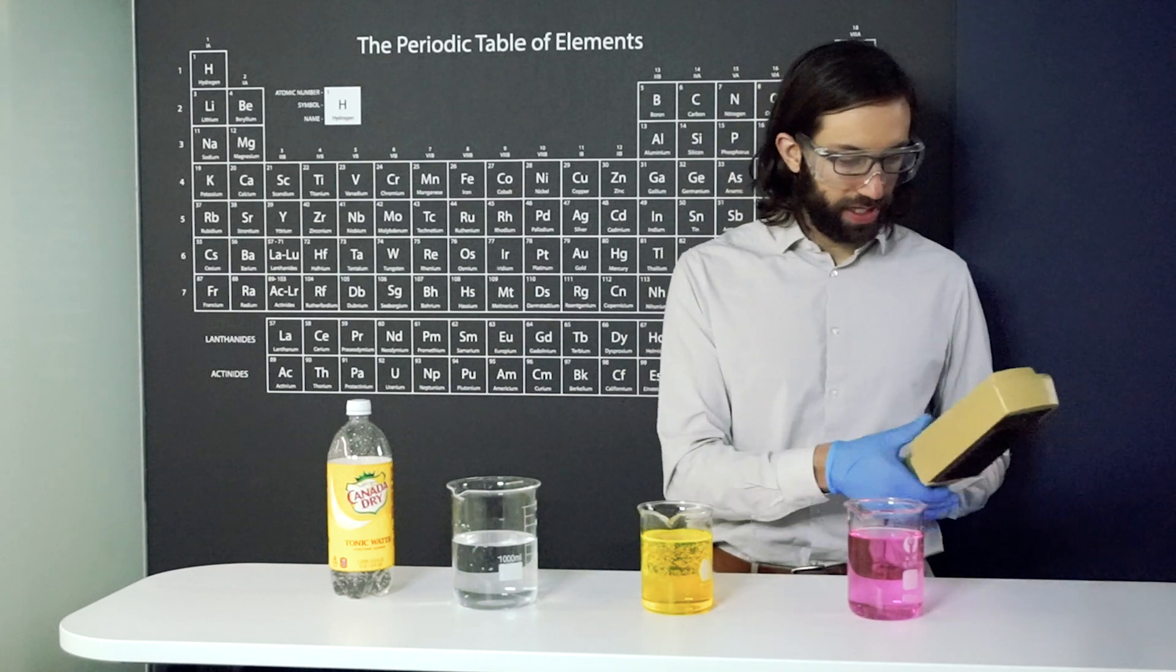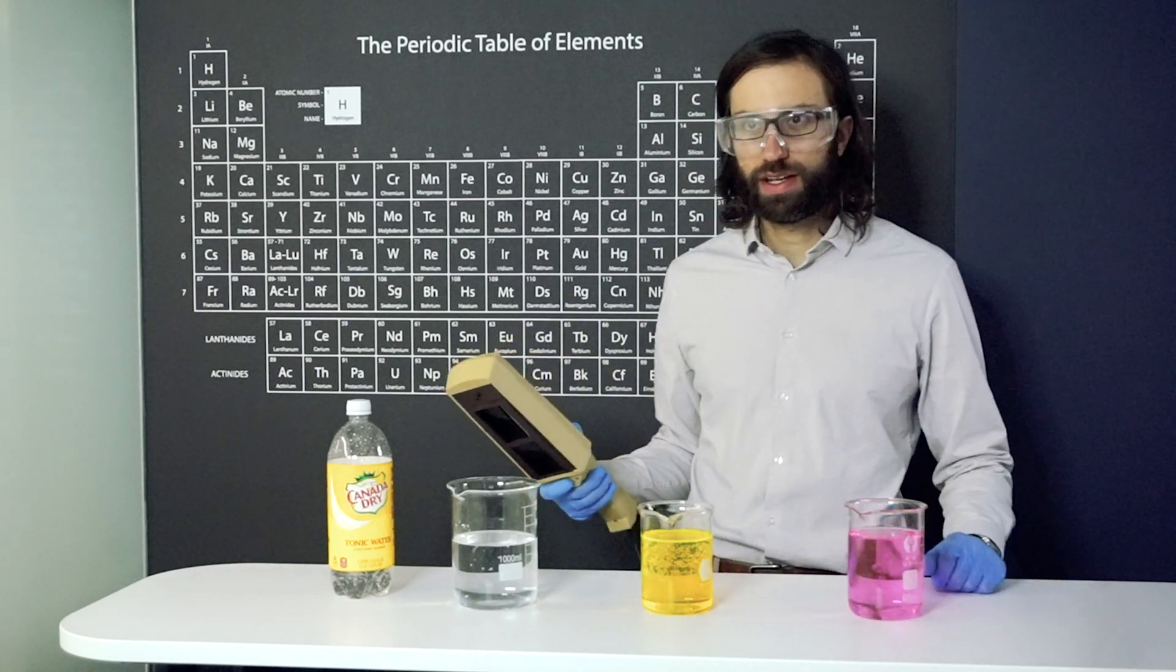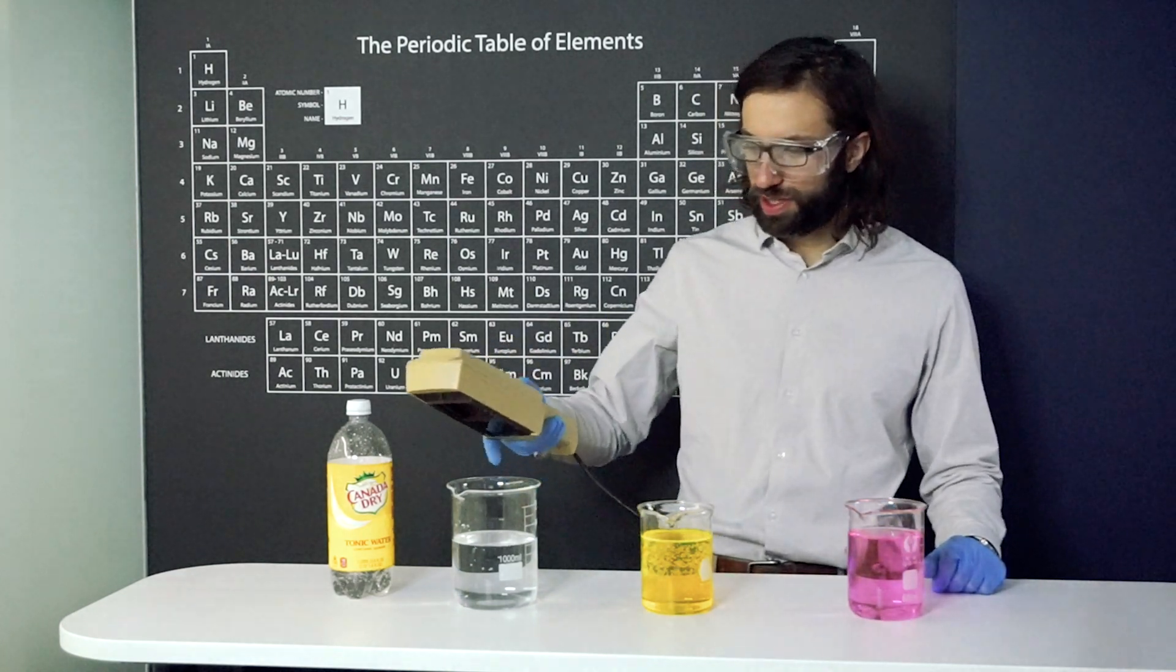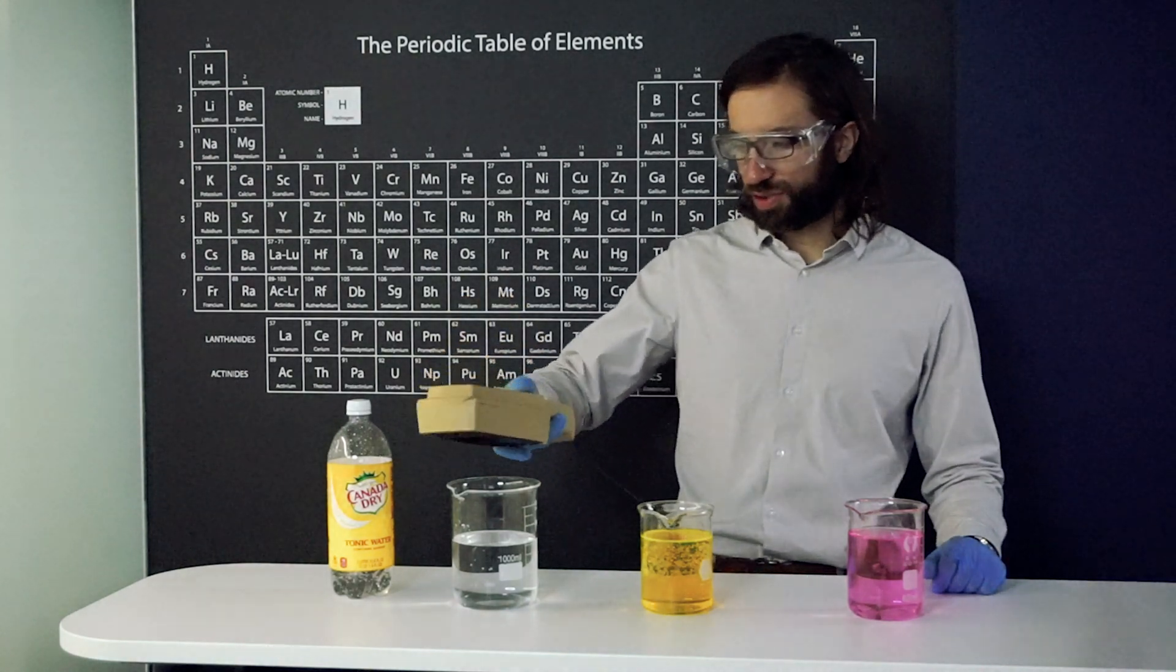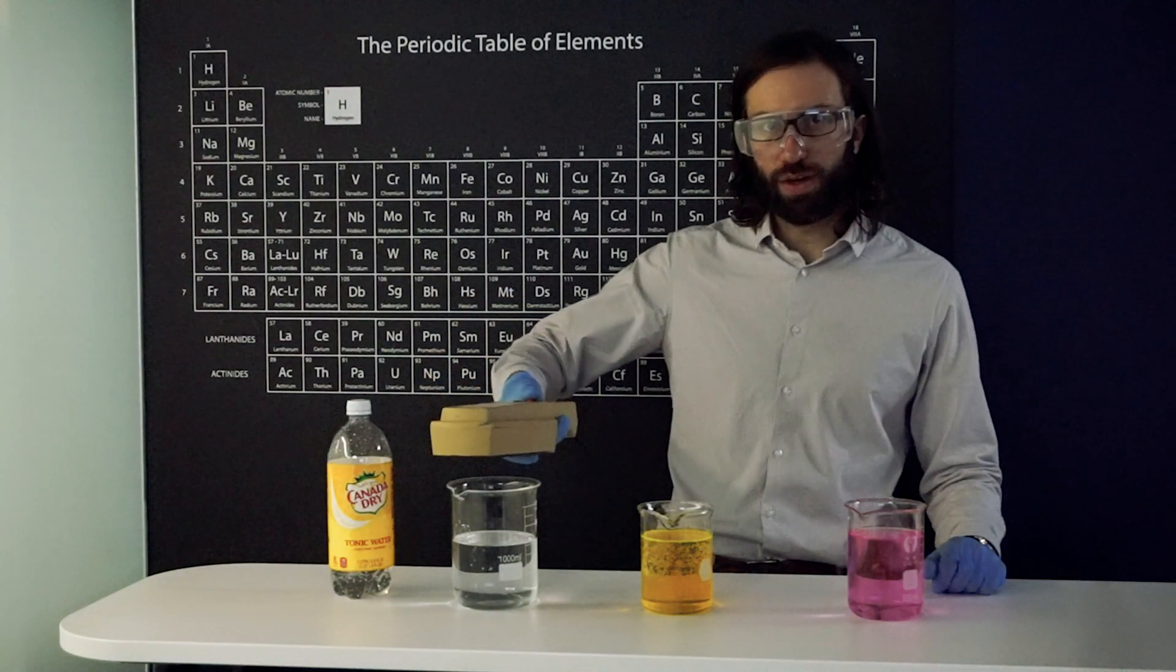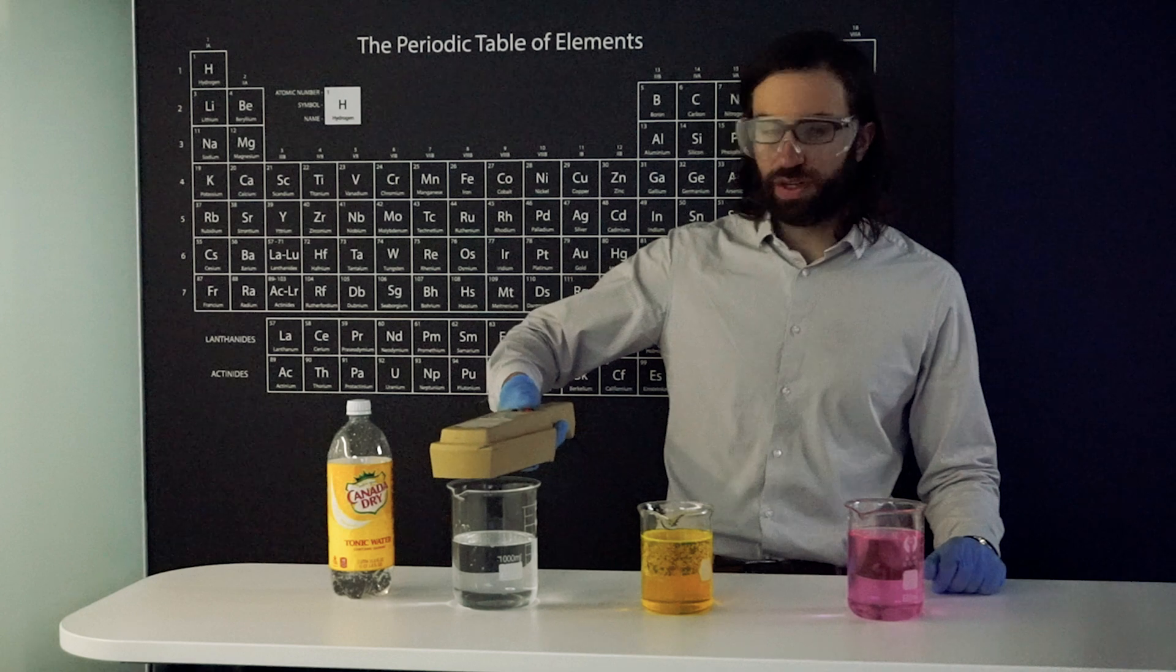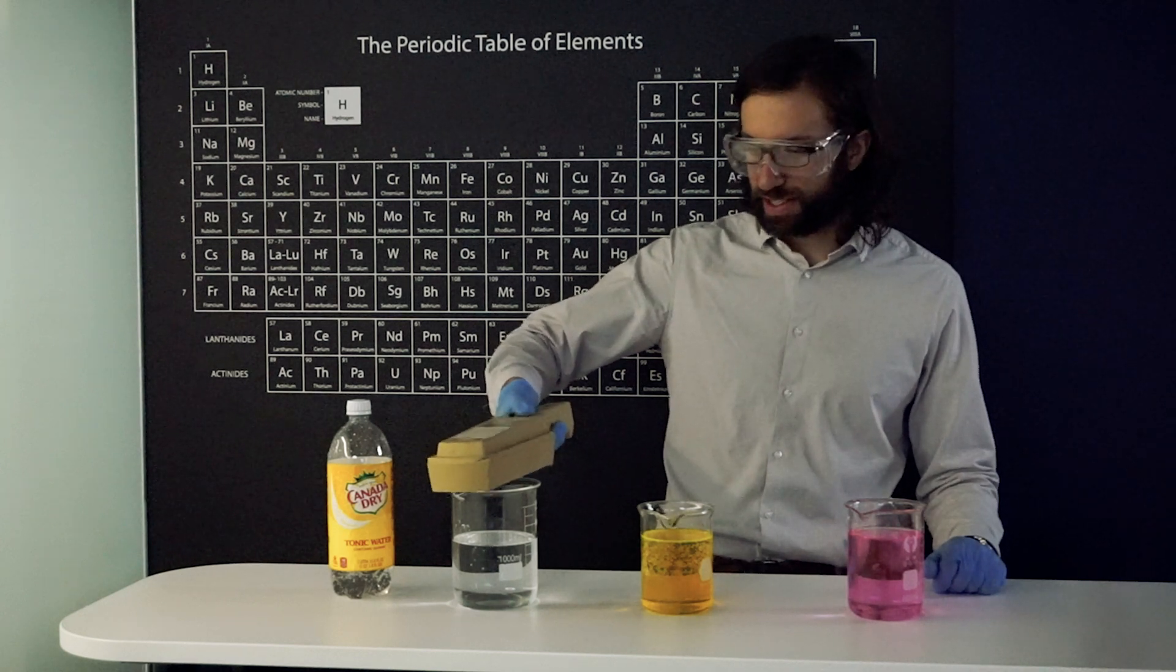And what we're going to do is cause these to fluoresce. And so we're going to use ultraviolet light. This is 366 nanometers ultraviolet light, also known as black light, because you can't see it.